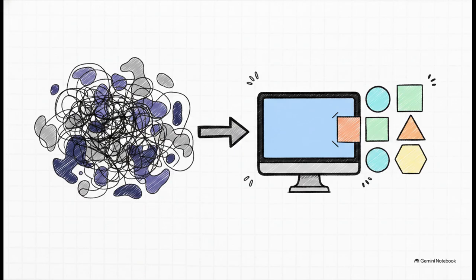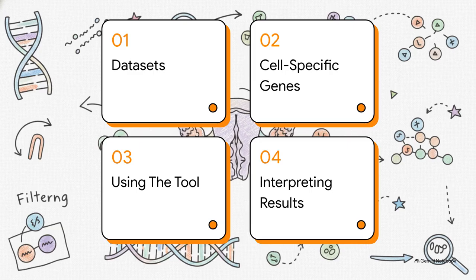Enter PlacentaCellEnrich. This is basically your bioinformatics shortcut. It was custom built to provide a highly reliable, efficient, and honestly super user-friendly interface. It completely empowers you to take that intimidating wall of data and instantly interpret your complex gene sets. And the best part? You don't need to be a computational wizard writing your own custom scripts from scratch to do it.